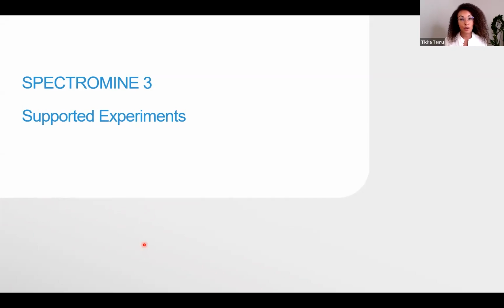Okay, so I think we can have a look at the results. Great, so most of you do LFQ, then it's 71%, and 42% also do ILQ, and 23% don't do DDA quantification at all.